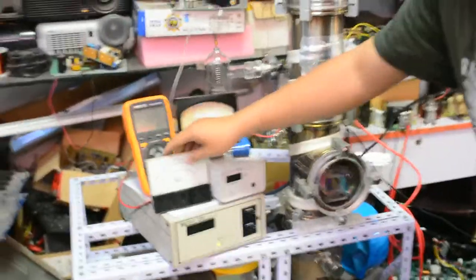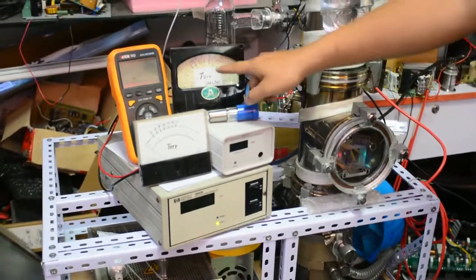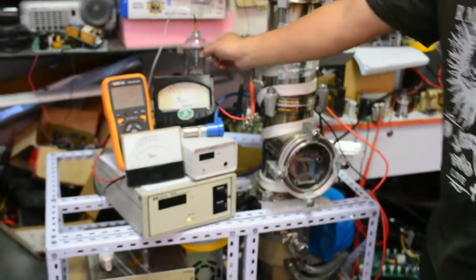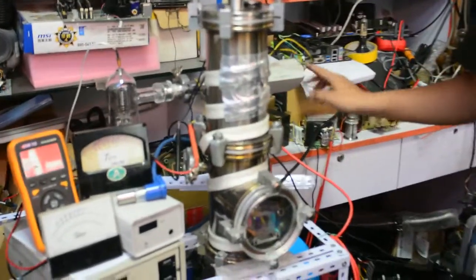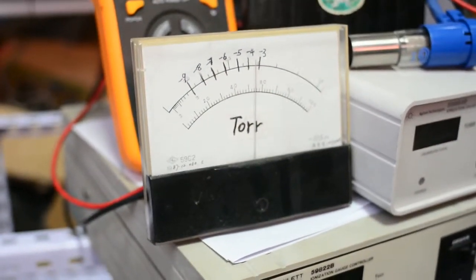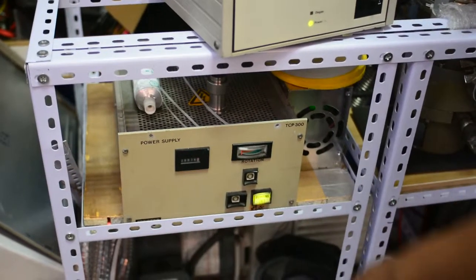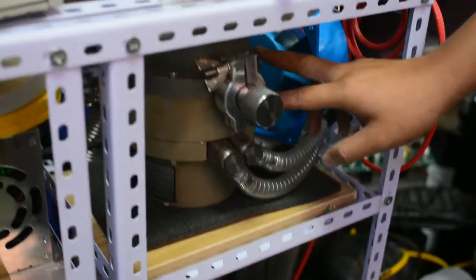Let's turn on the Pfeiffer vacuum gauge. At this level of the vacuum system, I'm not turning on the turbo pump yet, and I'm not going to use the glass bulb gauge because of the filament material. First, I'm turning on the Pfeiffer gauge. After it completes a self-test, it can read out the vacuum level in voltage. Now I'm turning on the turbo molecular pump power supply — when I turn it on, you can hear it spinning up.